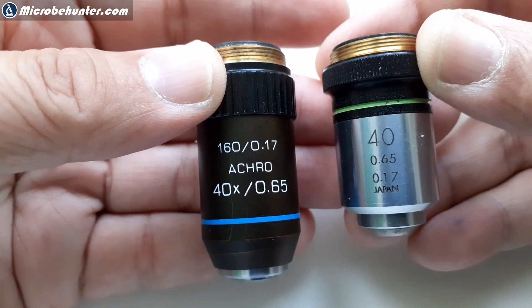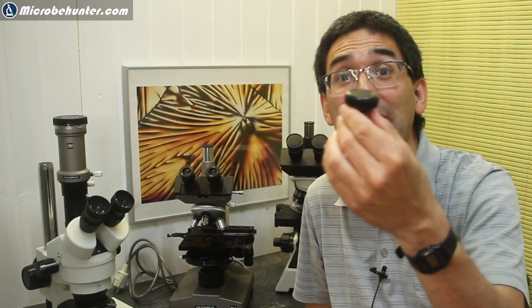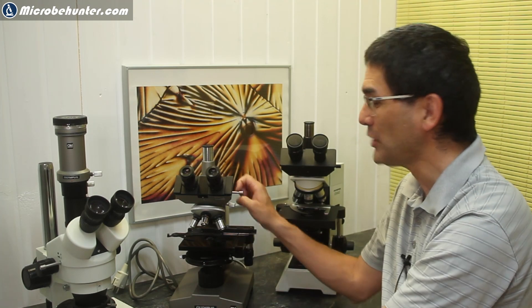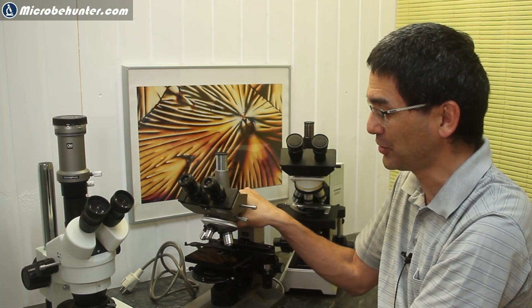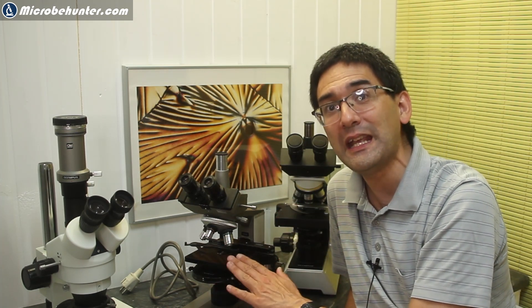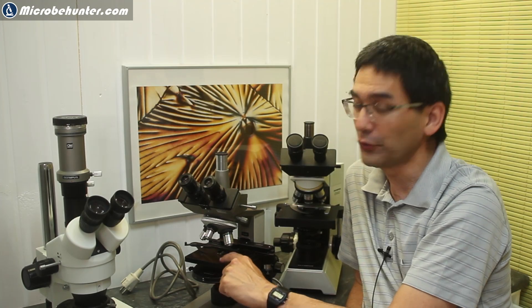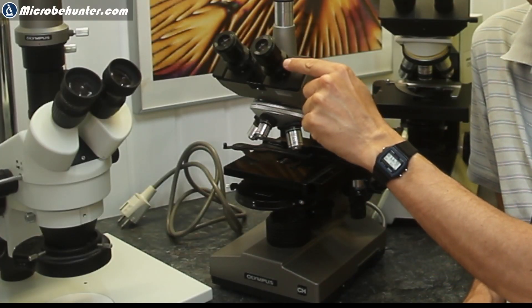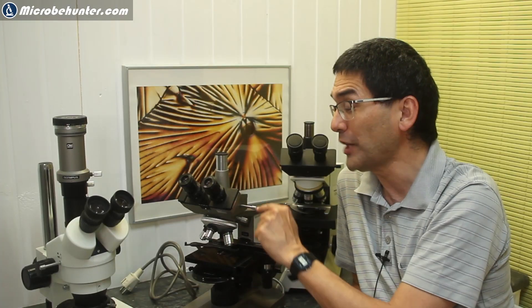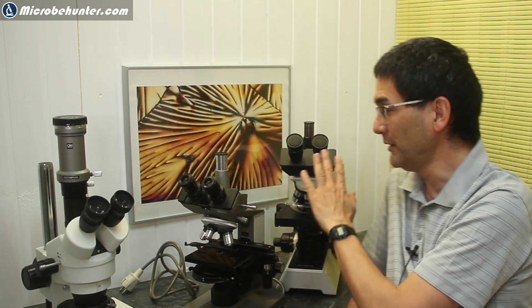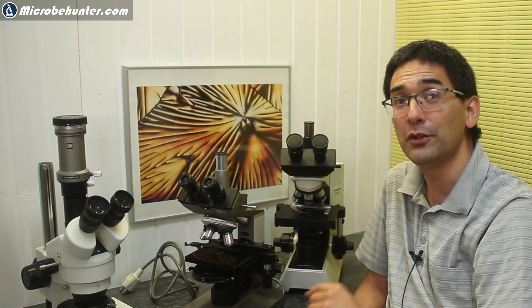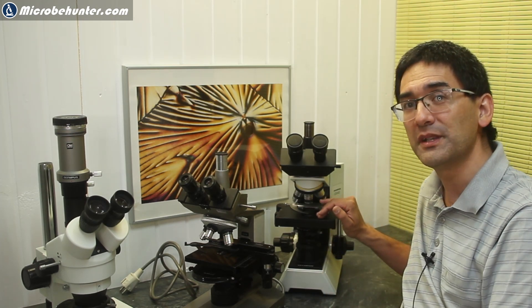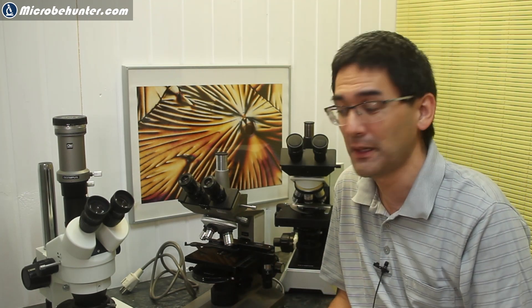The shorter one here has a conjugate distance of 185 mm, and this one, the longer one, has a conjugate distance of 195 mm. If you look, for example, at this Olympus CHA microscope from the 1980s, this microscope has a conjugate distance of 185 mm, and this means that the distance from the stage all the way to the place up here where the image is projected is 185 mm. And the other Olympus microscope I have over here has 195 mm, so it's slightly larger.